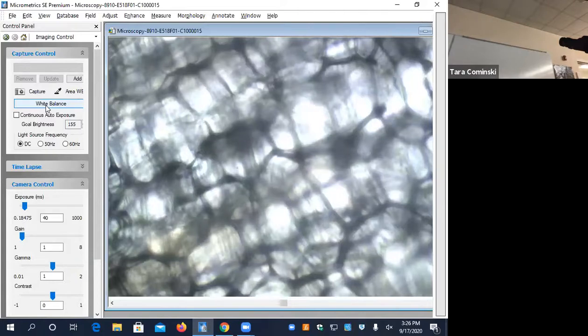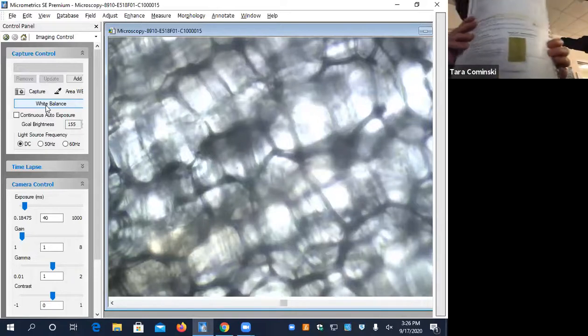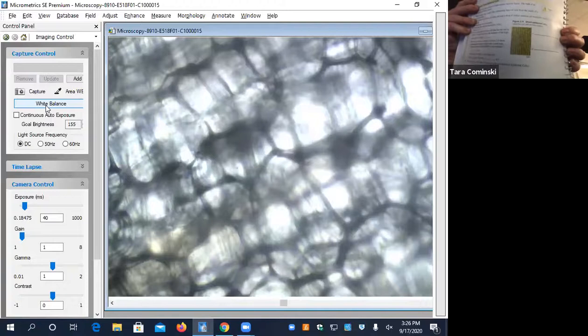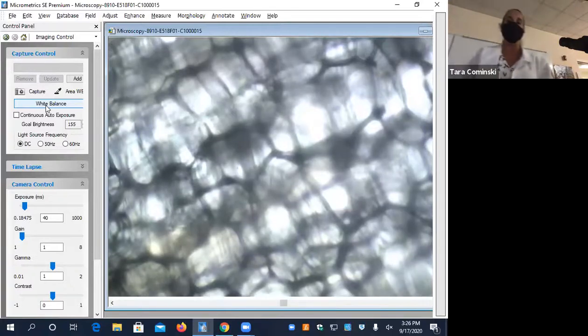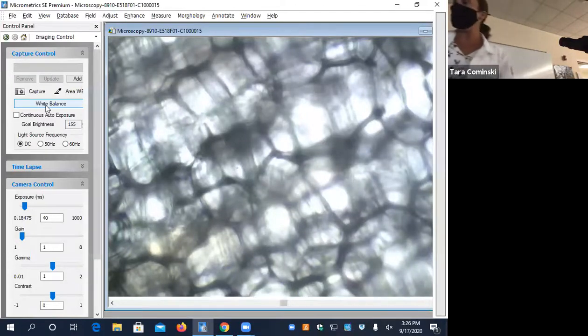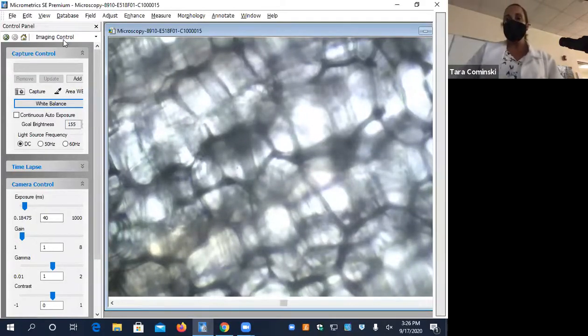That's fine, that looks good. This is the picture that's in the lab manual, and it's also in the PDF of the lab that you did, on page 24 of that PDF. For those of you on Zoom, I think you probably got all the information you need. You just need to submit that electronically.